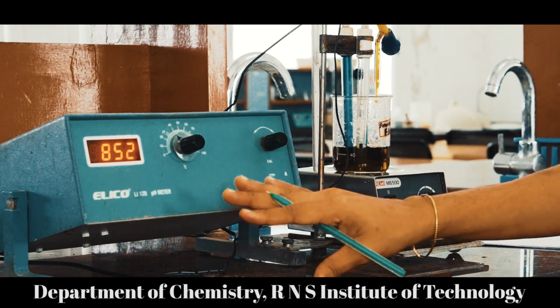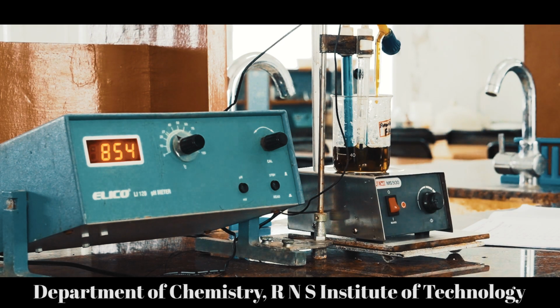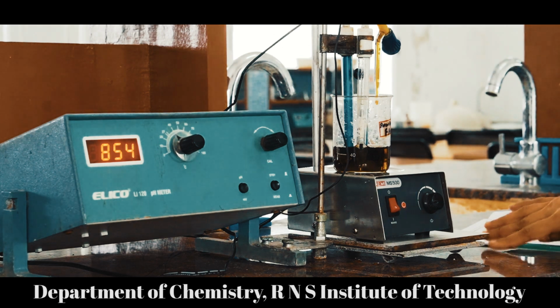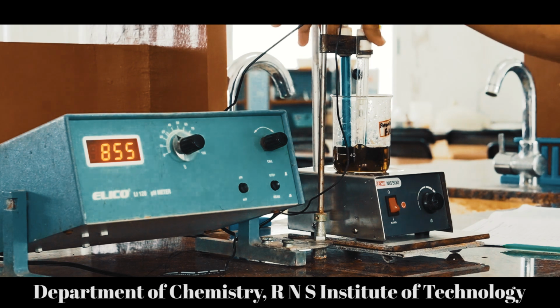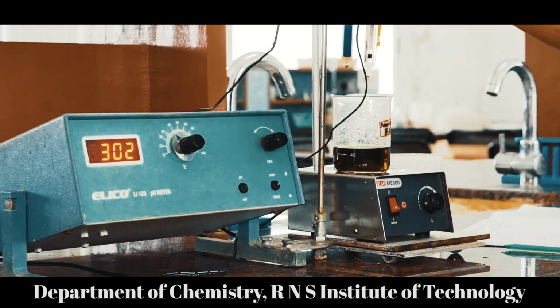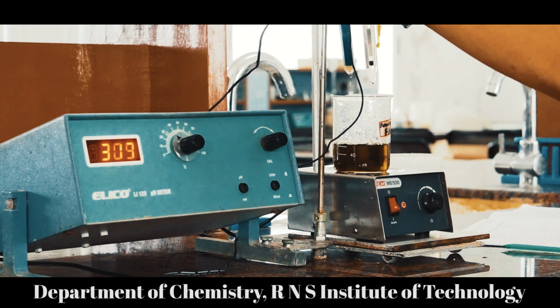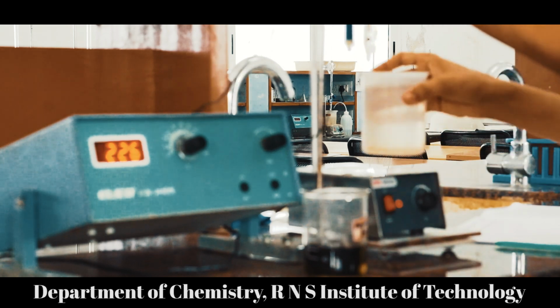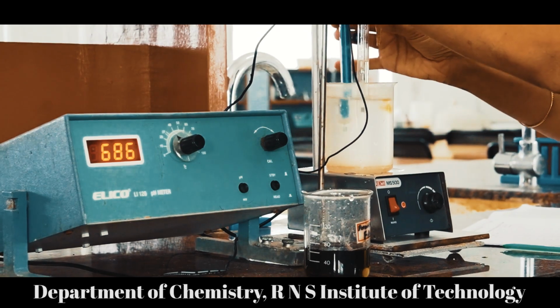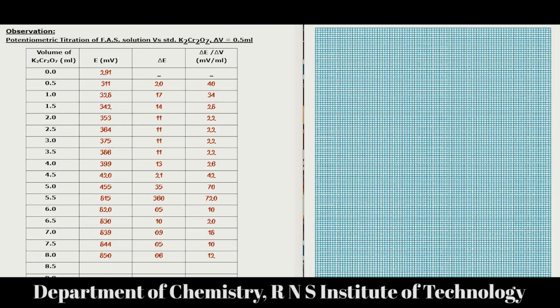Now we have taken 6 more readings. Now switch off the instrument and wash the electrodes and place it in the clean water bath. So these are the values we got from the experiment.